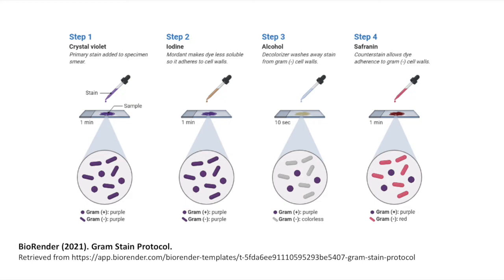The next step is to treat with an organic solvent. Some protocols will use alcohol, others will use acetone — which is the one we'll see today — and some others will use a mixture of both alcohol and acetone. In any case, the goal of this decolorisation step is to remove the crystal violet iodine complex preferentially from the negative organisms, thus enabling you to follow up with some form of counterstain — safranin is demonstrated here — to highlight the negative organisms.